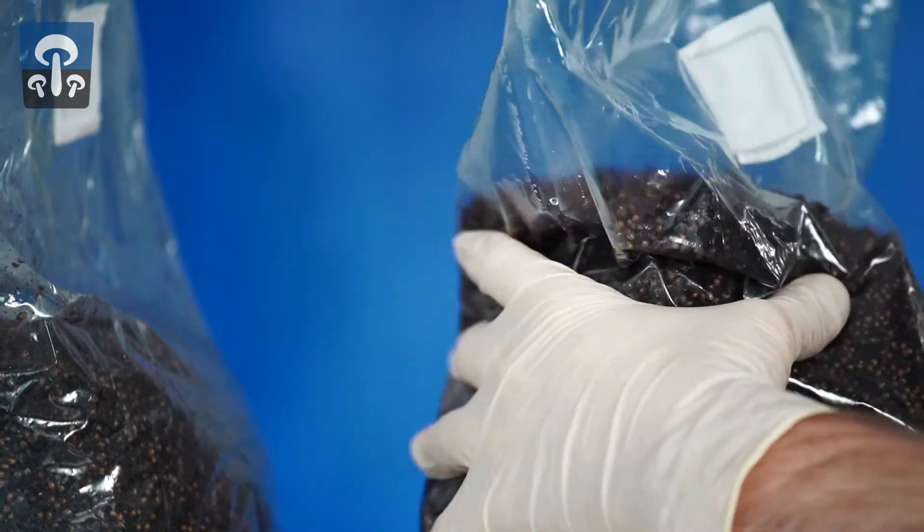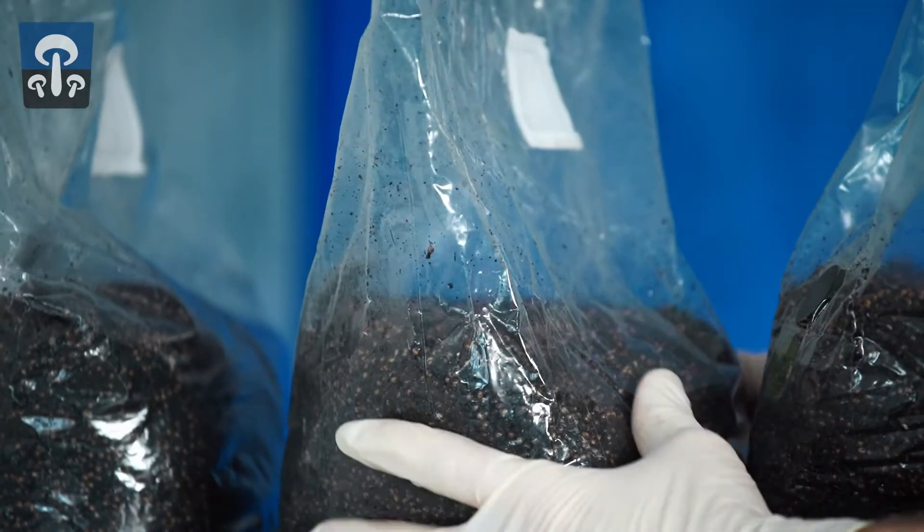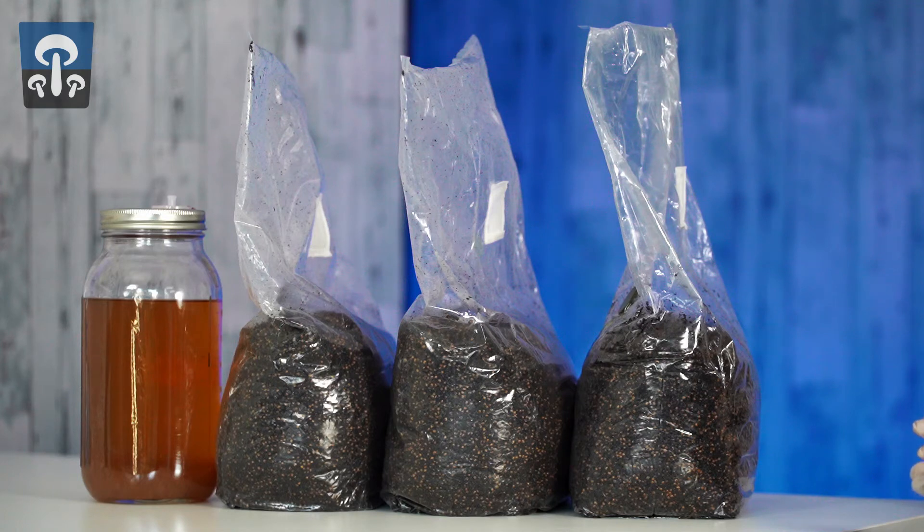We're going to start by breaking up any solid chunks in the substrate and allowing it to stand so air enters the bag. This will make mixing much easier in the next step.